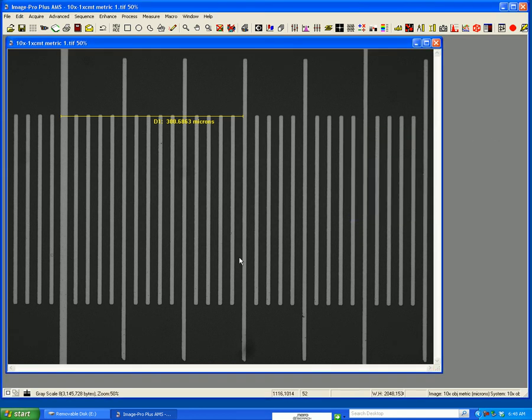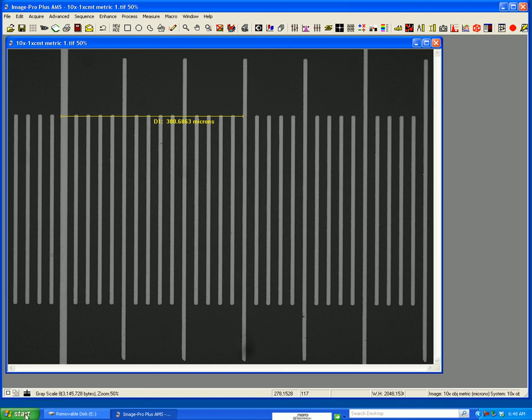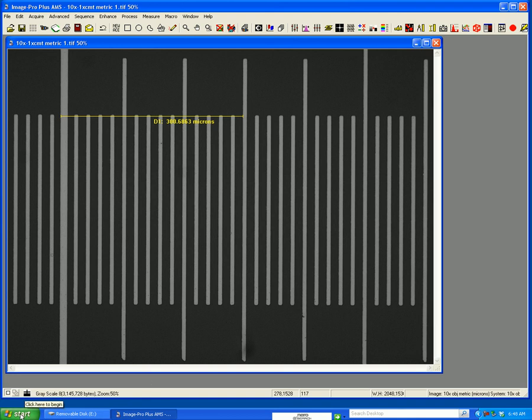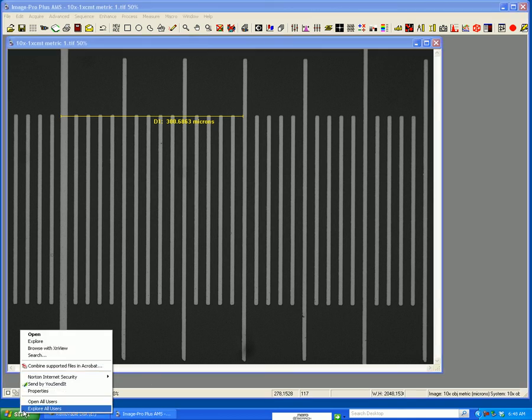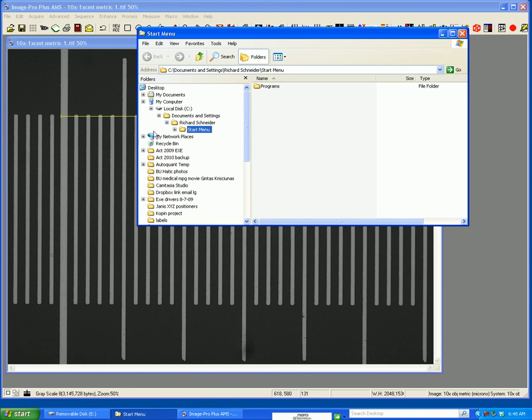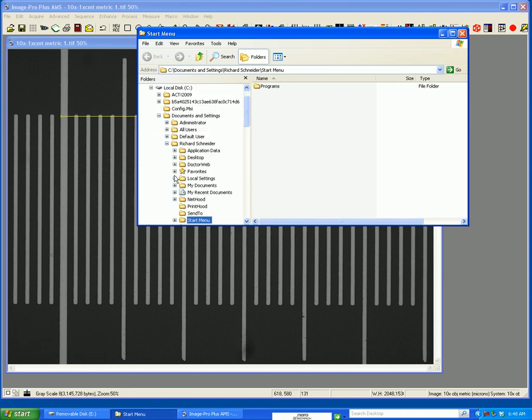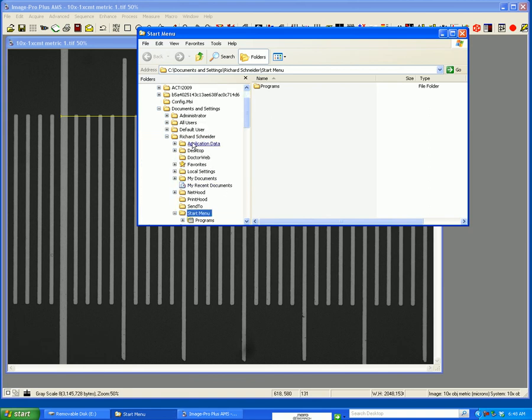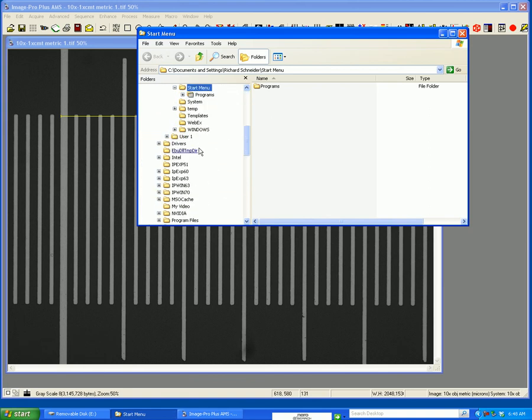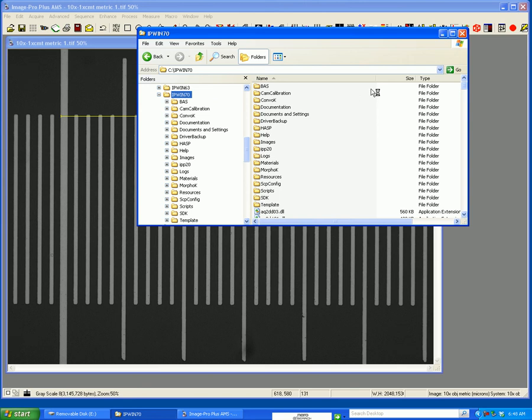One last note, these are stored in what's called an ipref.cal file in the directory for either ImagePro or QCapture Pro. If I right-click on the start menu and I go to explorer and I'm going to go to, if I can find it, the directory.